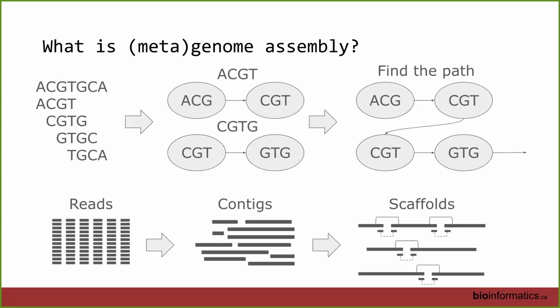So what we do is we create our network, we find our path. That means we take our reads and we stitch those reads together to create more contiguous segments. That's why it's called contigs. So contig stands for contiguous sequence or contiguous region.